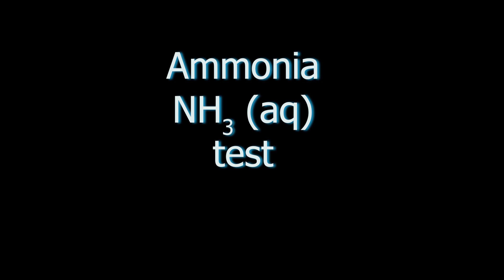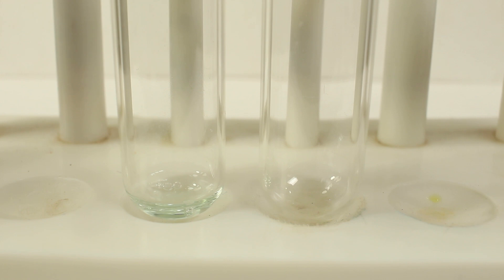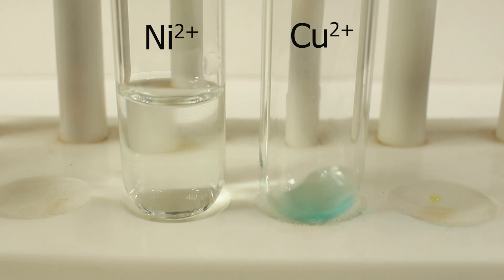Ammonia is an alkaline gas forming alkaline water solution, and also it can form complexes with transition metals. So let's see which complexes it forms with copper II ions.